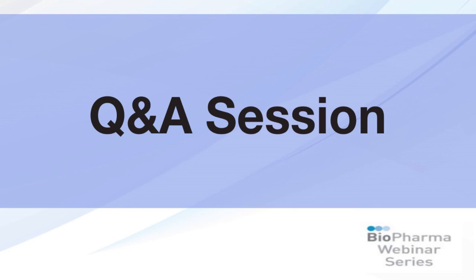Yeah, that's a very good question. And there's a number of people out there who are trying to do direct identification from SWATH data. This is what I would call the cutting edge of SWATH research at the moment, and there are a number of techniques to do that. One that's fairly well respected is the DIA-Umpire approach from the Nesvizhskii group. The challenge there is that you still don't seem to get the same level of identification numbers as you do from the IDA or DDA methods.